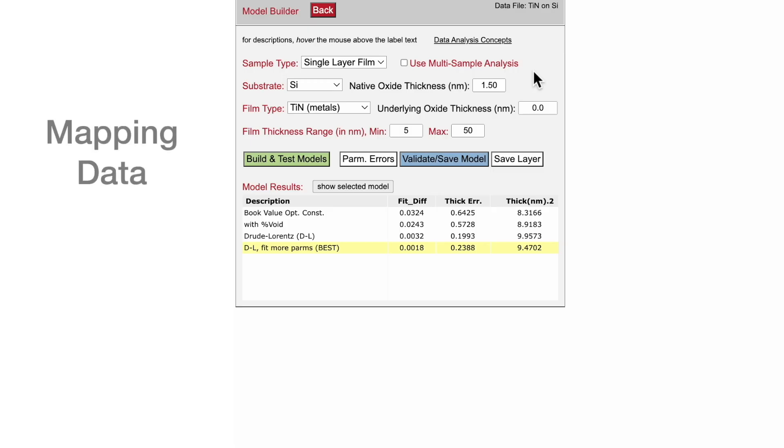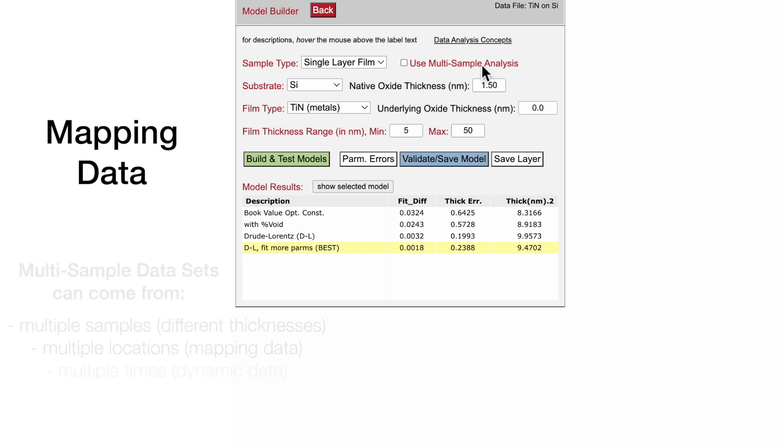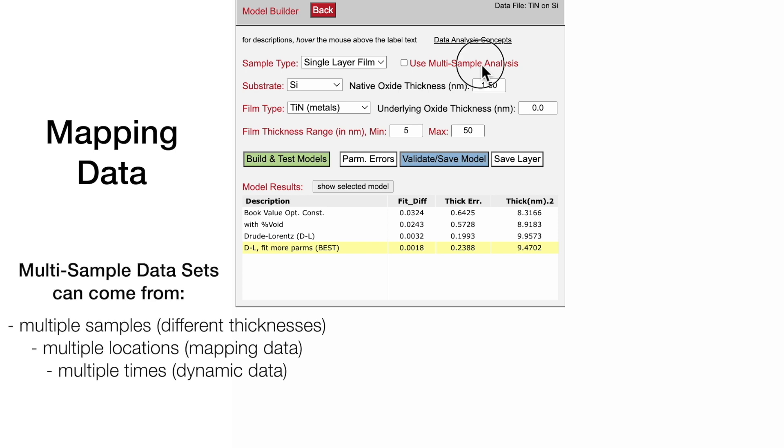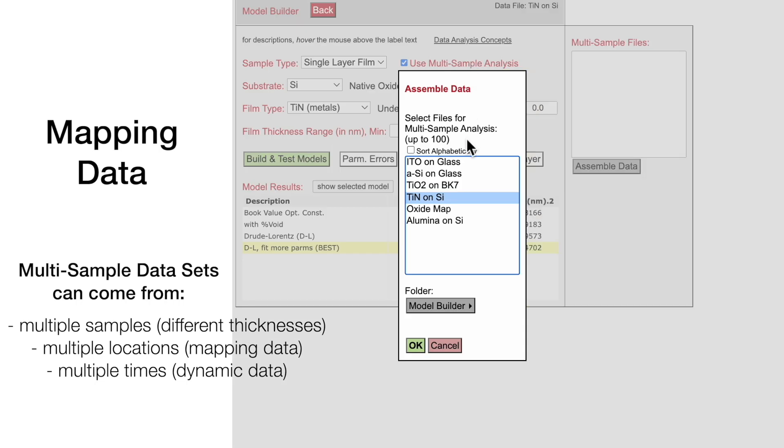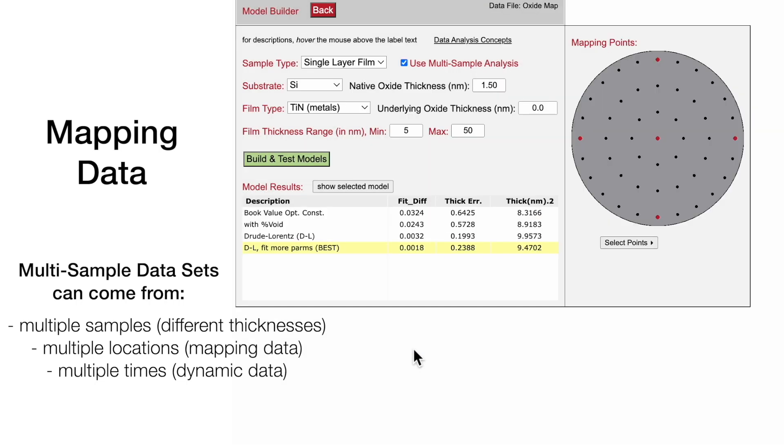Model Builder can also analyze automated mapping data. This provides a good opportunity to demonstrate the multi-sample analysis capability, which combines data measured at multiple locations across the sample in the analysis. By default, Model Builder selects data in the middle, left, right, top, and bottom of the sample.